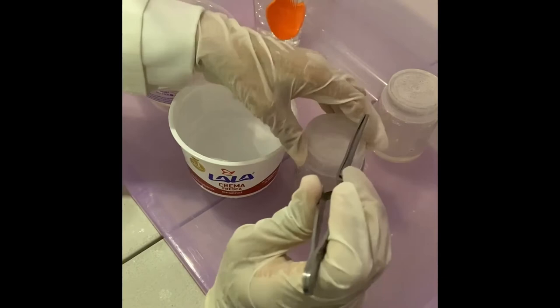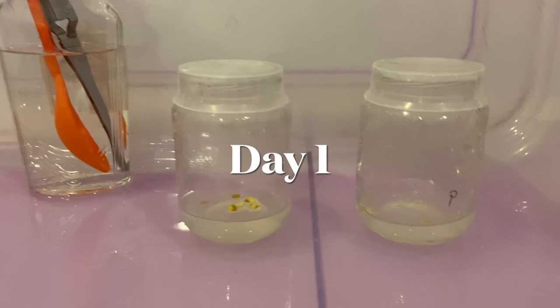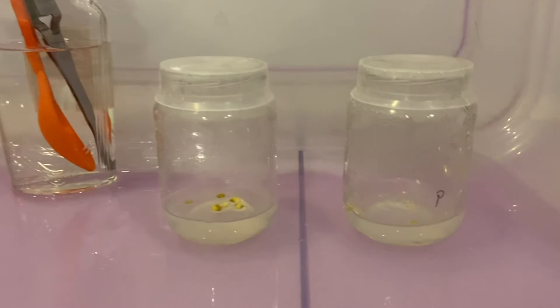Then I left the flasks closed with their lids inside a box at a room temperature of about 20 degrees Celsius in natural sunlight that came into the room through the window. These are the results I obtained during the next days.